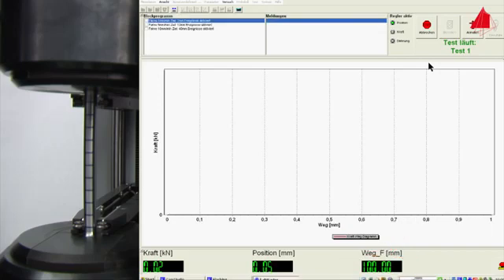During the tensile test, the test piece is slowly and constantly elongated with a standardized speed. The force that the test piece opposes to the imposed elongation is recorded and can be seen at the bottom left hand corner of the computer display. The material behavior can best be observed in a force-elongation diagram. The force F is plotted upwards on the vertical axis, the elongation ΔL towards the right on the horizontal axis.